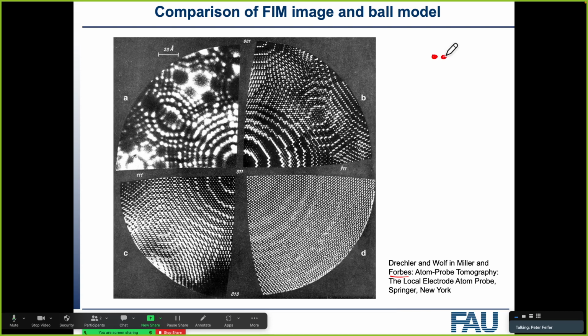So just imagine we're taking a crystallographic arrangement, and we're putting a curve through it. And that's essentially what they had their students do. Just take a lot of, I think in this case it looks like marbles or ball bearing balls or whatever, stack them on top of each other and make them into a sphere. And if you look at a field ion image, in this case of tungsten, I believe, you see that it's very, very similar. And then you can have a qualified guess of what the crystallographic orientation is.